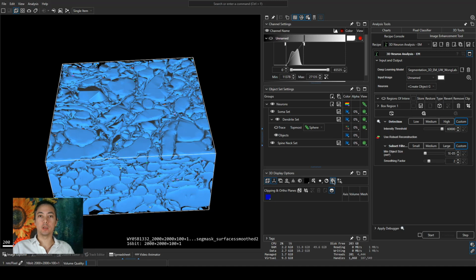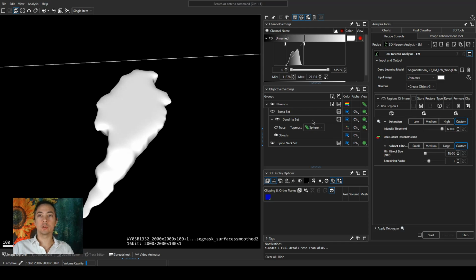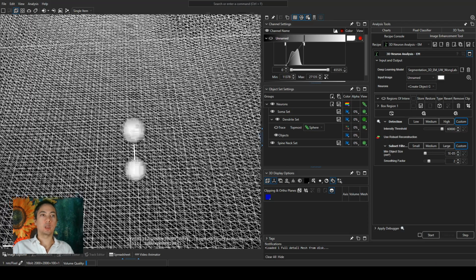I've got this option on. You can turn it off if you really want to force it, although if it's unable to load all of it into your video card, it won't work. So you probably want to just leave this one on. When you get close, it'll go to high, and I'll show that now. Just pick one, and then we'll hide everything else and go close. I can show you the high detail here.